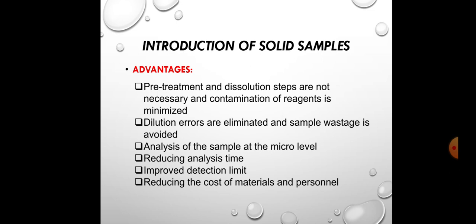Okay, if we have a solid sample, is it possible to introduce solid samples directly into an atomizer, for example, into a flame or into a plasma or into an electrothermal tube, a graphite tube, for example, to analyze it directly?